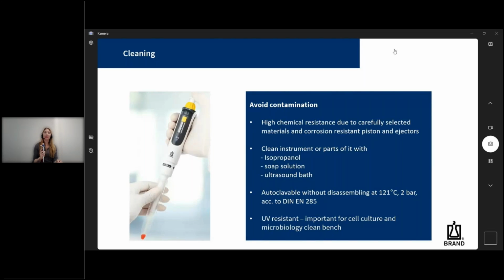Maximum safety is achieved through vacuum sterilization. We recommend the use of sterilization bags. If the pipette is autoclaved frequently, the piston and seal should be greased with the supplied silicone grease in order to ensure proper movement. After autoclaving, tighten the connection between the hand grip and the pipette shaft if necessary.